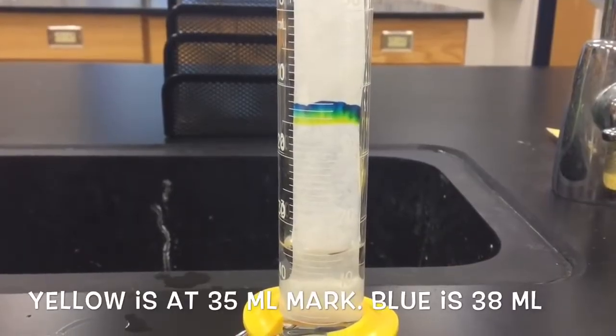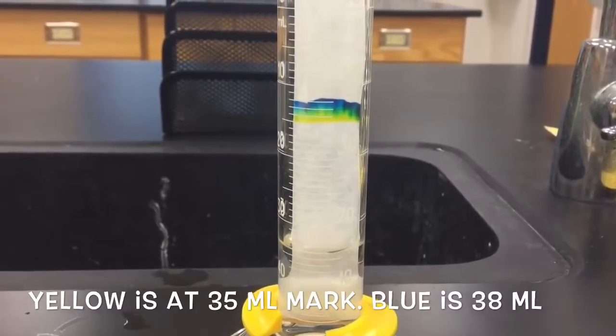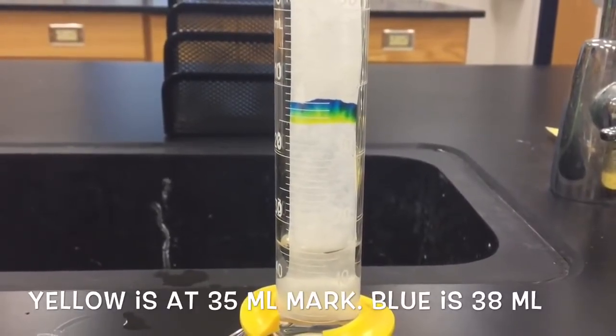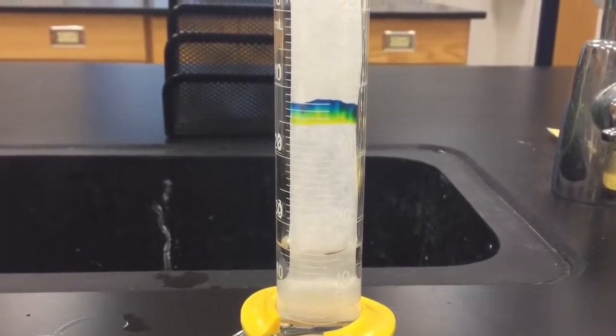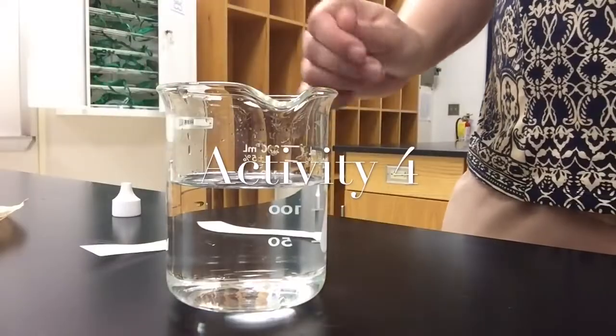We're going to check back with our chromatography paper. You can see the water is rising and carrying the molecules of marker with it. You can see the green still in the middle, the blue on the top, and the yellow on the bottom. We'll continue to check back with that.